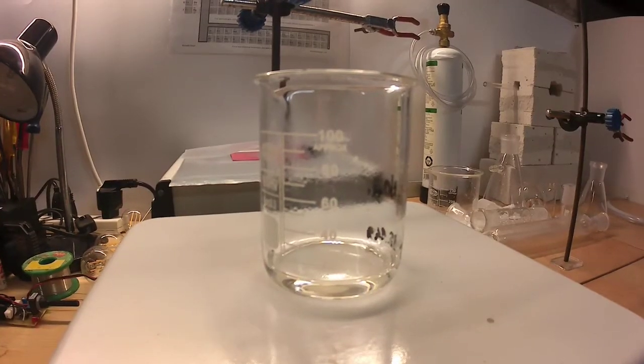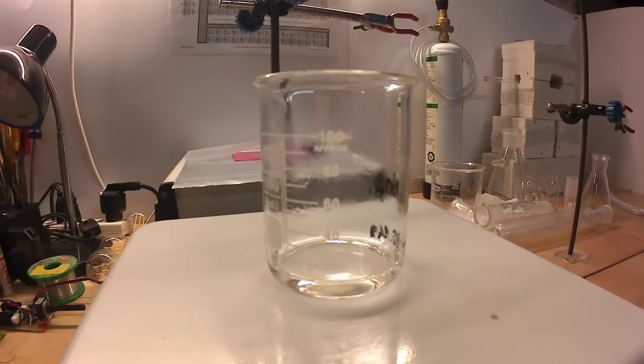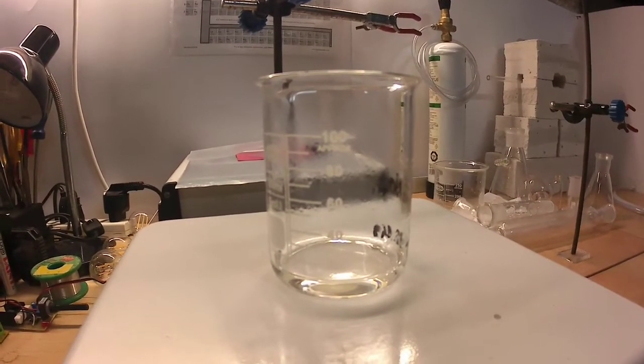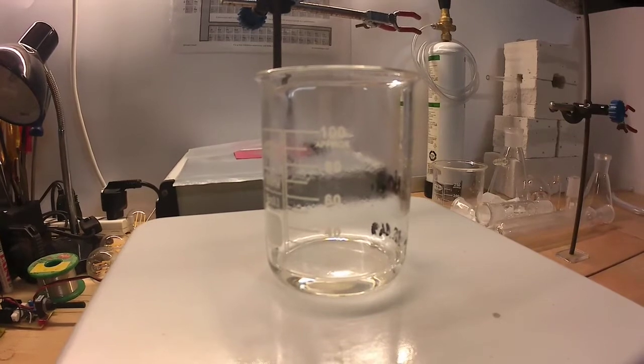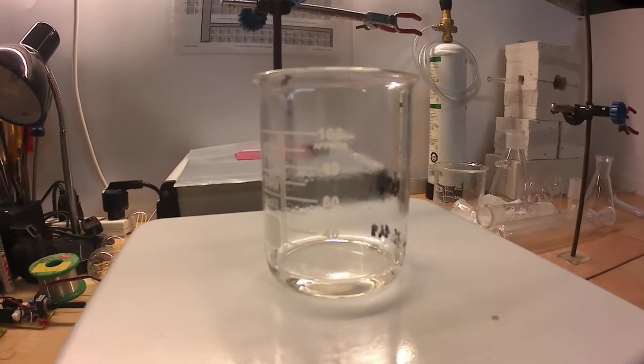At this point, the silver nitrate was transferred to a beaker and put on a hot plate to evaporate the water. Don't set the hot plate temperature too high, silver nitrate is a salt that melts at a low temperature.